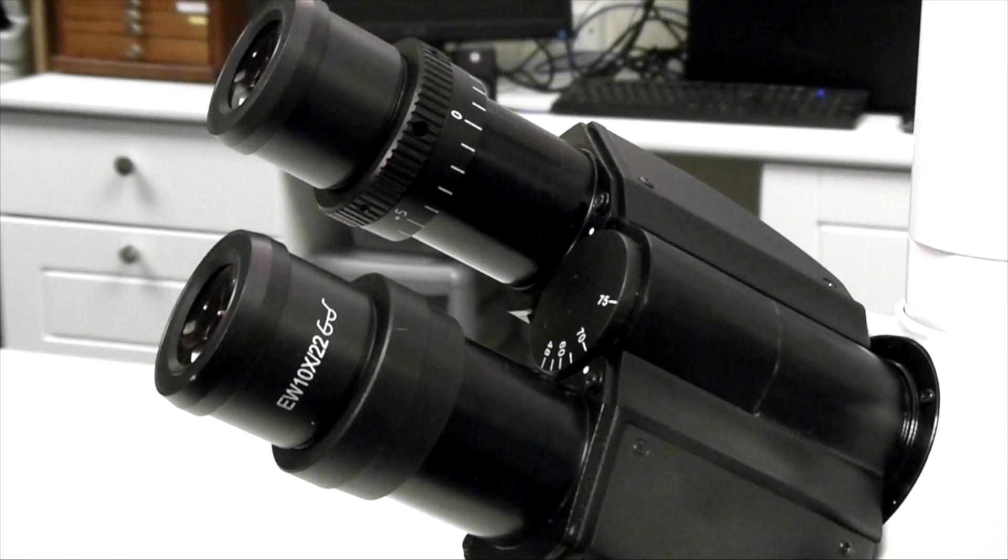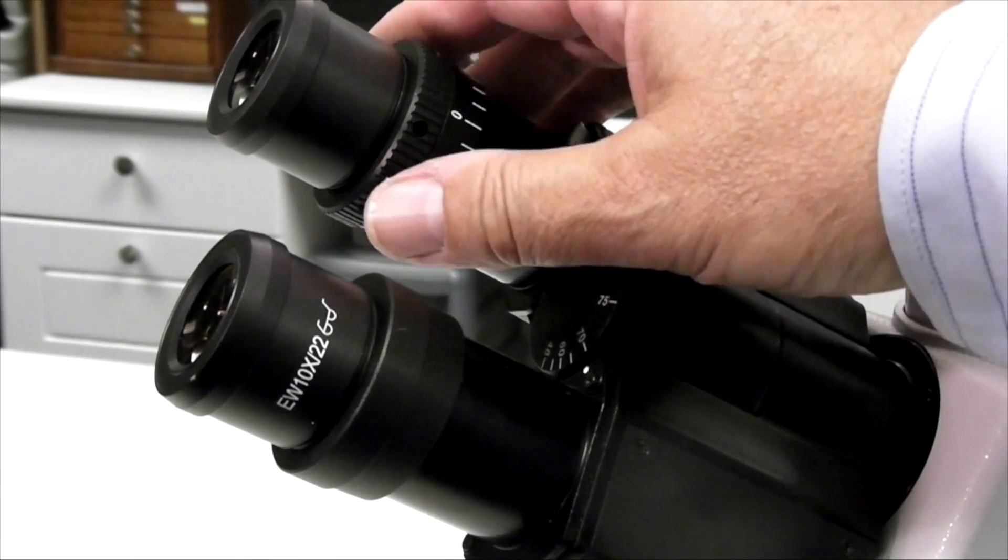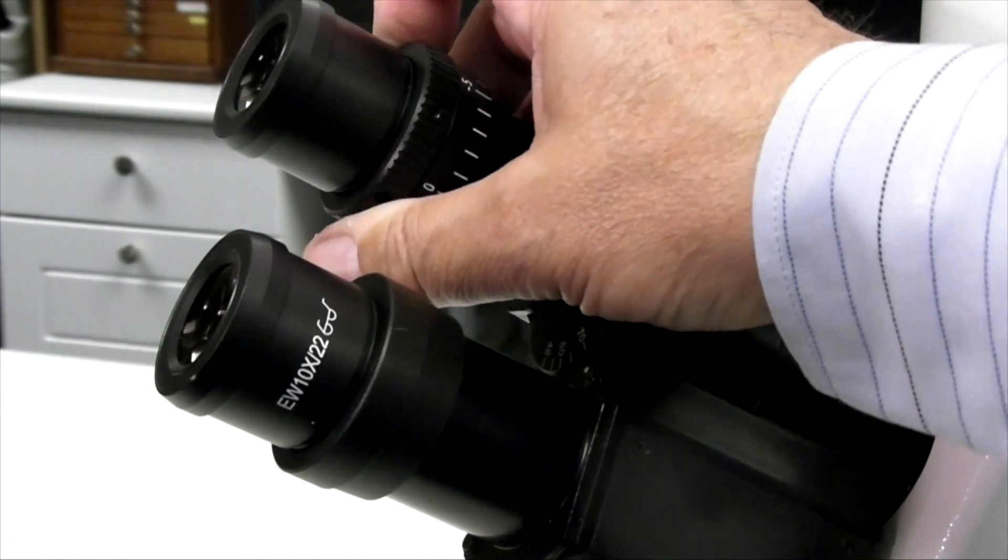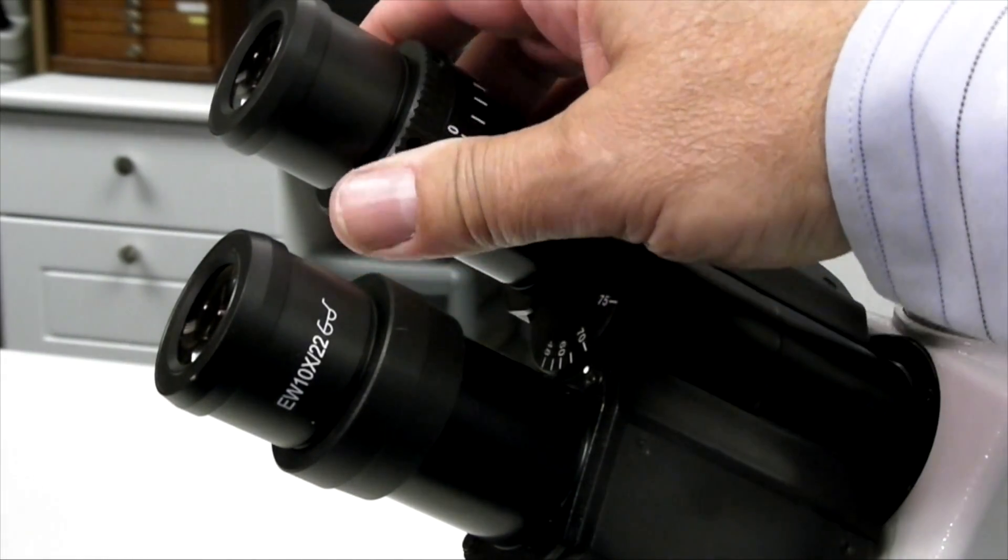Many individuals have eyes that focus differently. The eye tubes of most high power microscopes have one, often the left hand, which will focus independently of the other. To set these correctly, look through the fixed eye tube with the other eye closed.